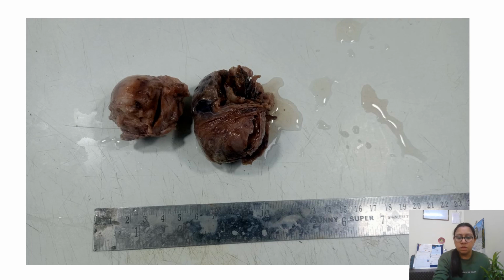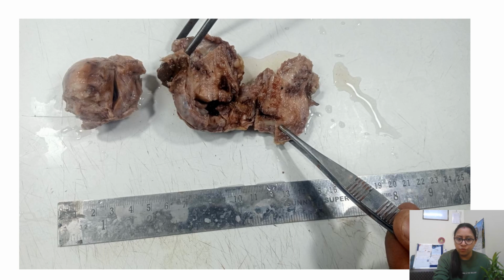So this was the mass which we received. You can see bilateral, both sides of the ovary. This is the cut section. This is the external picture of the mass, and this was the cut section.